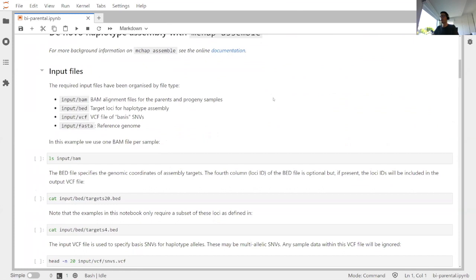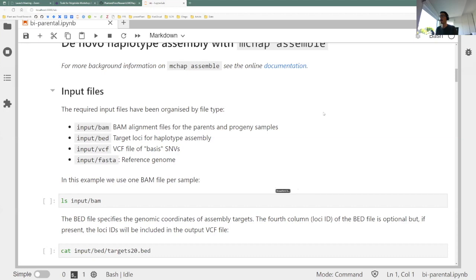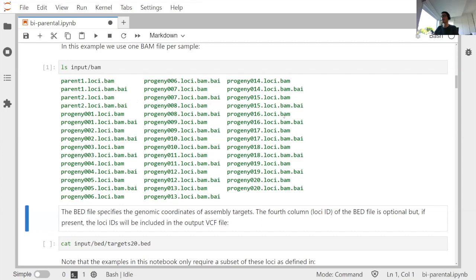The input files for MCHAP assemble are: a BAM file containing sequence data, one per sample; a BED file specifying target loci — effectively specifying the haplotype blocks or haploblocks; an input VCF file specifying basis SNPs used to assemble haplotypes; and a reference genome. In this small dataset, we're looking at two parental samples and twenty progeny from those parents — a simple bi-parental cross.